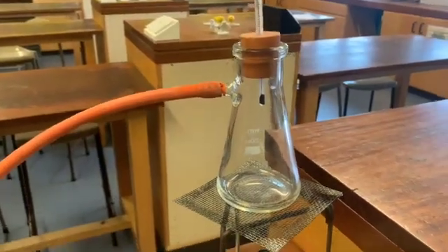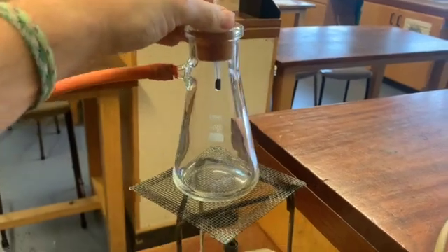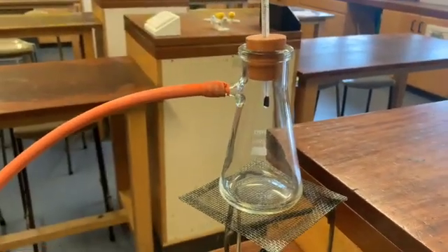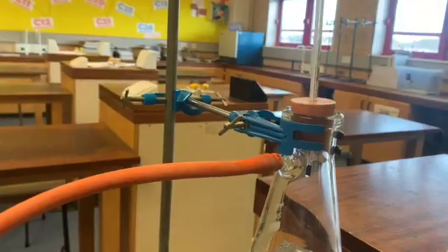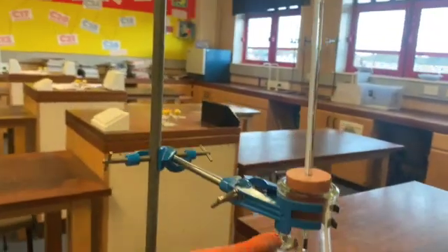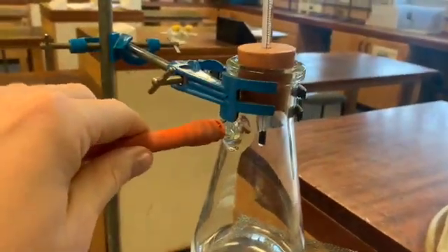Now we need to think about the safety of this experiment. Being so high up, it's actually quite easy to wobble this around, so what we need to do is make sure it's clamped in place. I've just clamped it with a retort stand here, and that will stop it from being wobbled over.